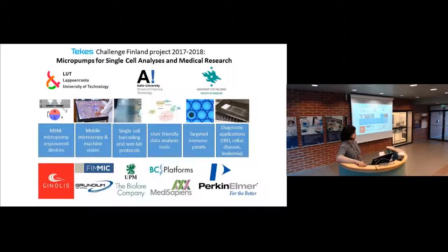I think the customers for those mobile phone sequencers are also researchers who probably need to go to a jungle and sequence Ebola or something on site. You can't bring the Illumina machine to the jungle, and you have to do the sample prep somewhere in the very rural areas if you want to do research on site.